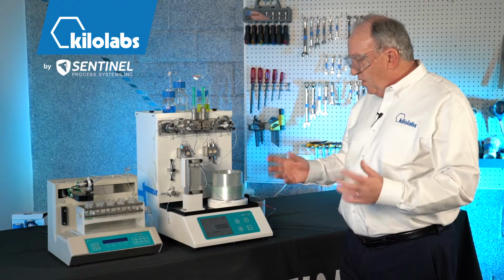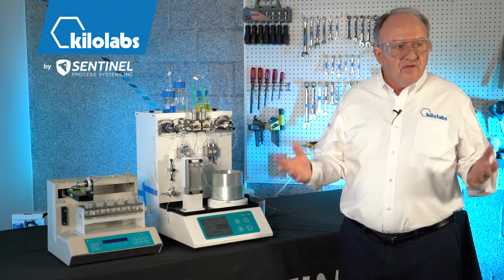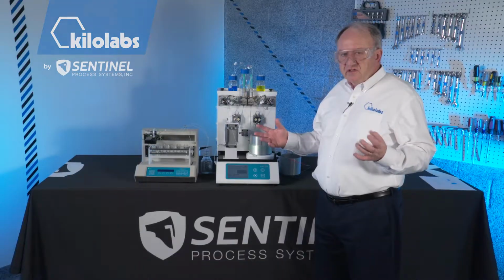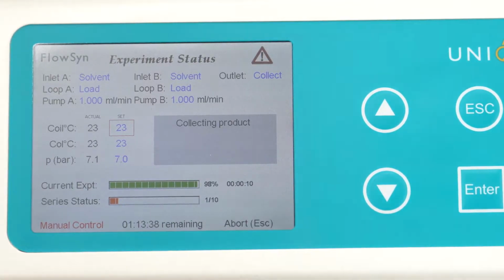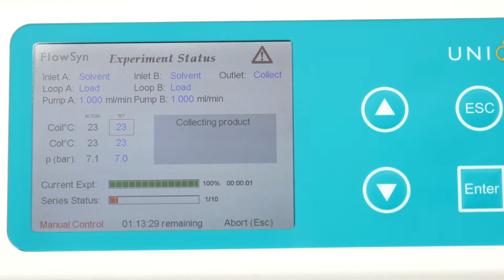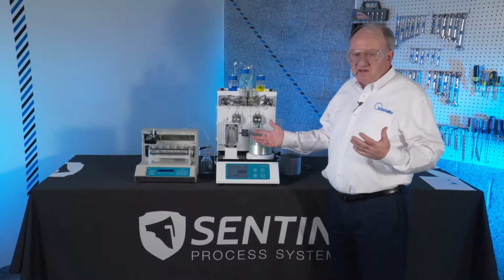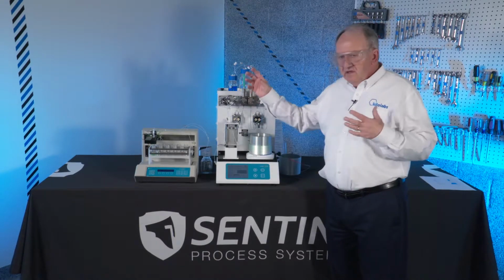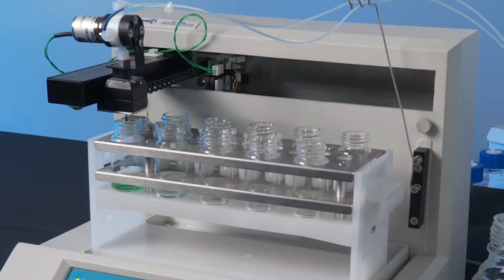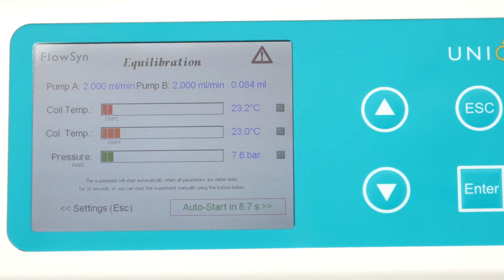Once that is over, the system will reset based on the table I put together at the very beginning, and we'll get the second experiment started. We'll show you that as well. You can see that it just goes over and over again and does exactly what you want. In an hour and 16 minutes, for the way I set the table up, you've got 10 experiments, your samples are collected in vials, and they're ready to be analyzed.